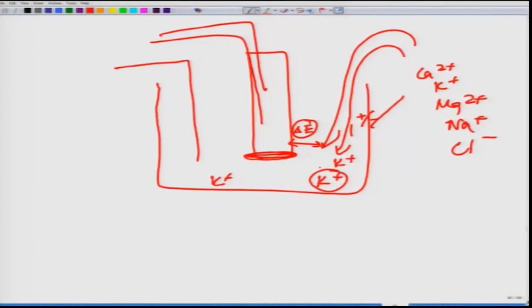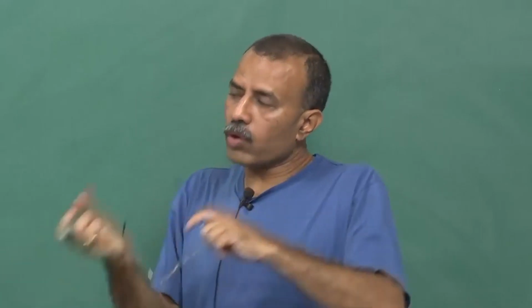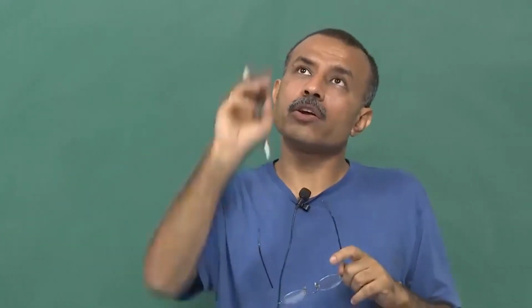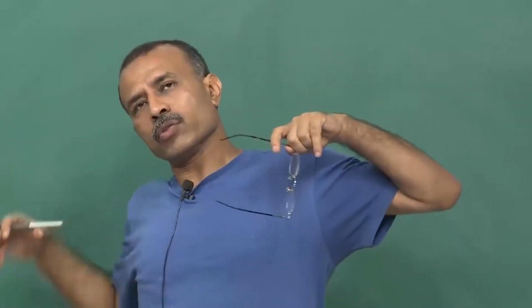So, for that what you need on this membrane is a selective binder to a particular ion, and that is the key. In this case I gave you the example of valinomycin, which is a kind of cyclic peptide that binds to potassium and ferries it inside the cell. If you coat that membrane with valinomycin, it will pull out the potassium ion and take it inside, and it will maintain an equilibrium. Now, if you add more, it will ferry more.